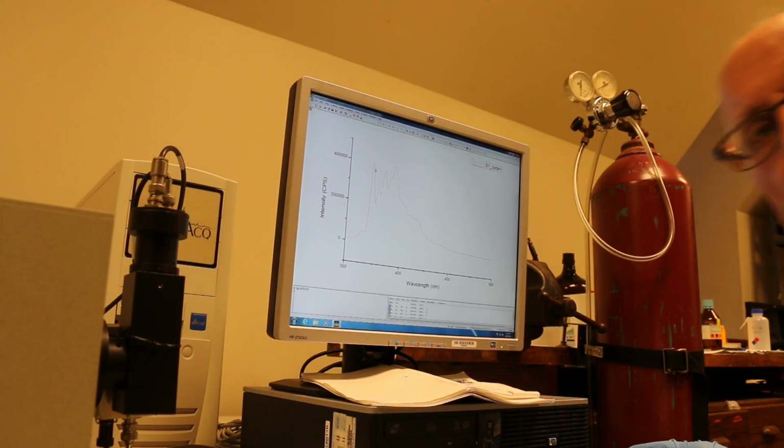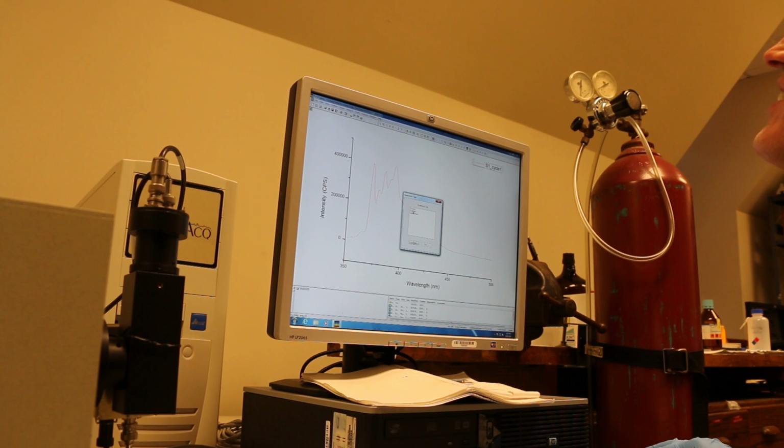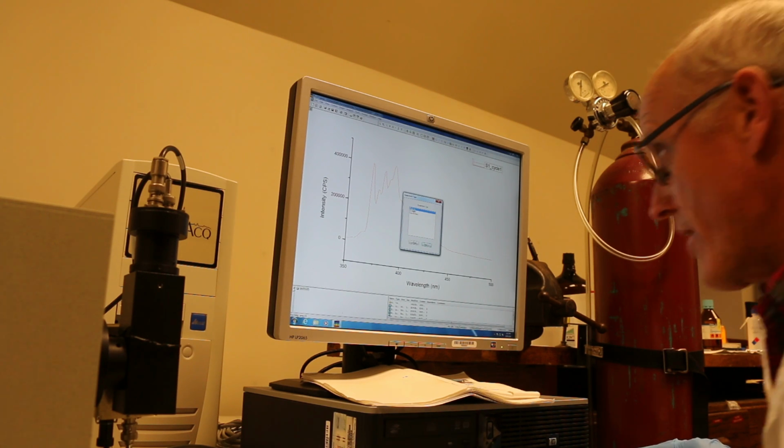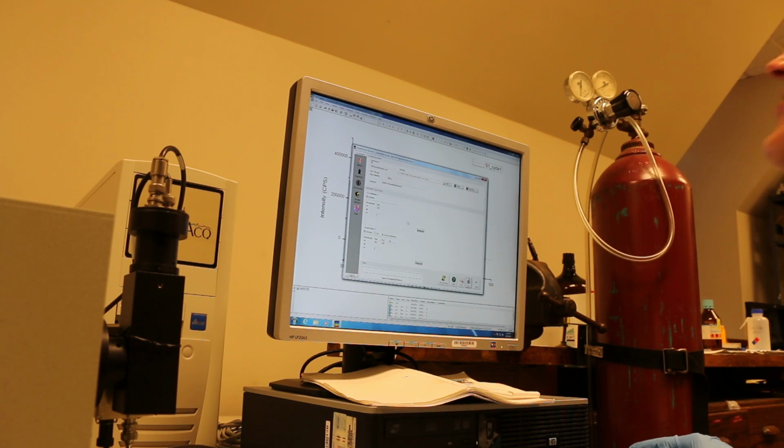I don't know if you see me there. Maybe you can. But I'm going to go ahead and select another experiment, and this will be an emission experiment. And I'm going to excite at 350 again, and collect emission from 365 up to 700.